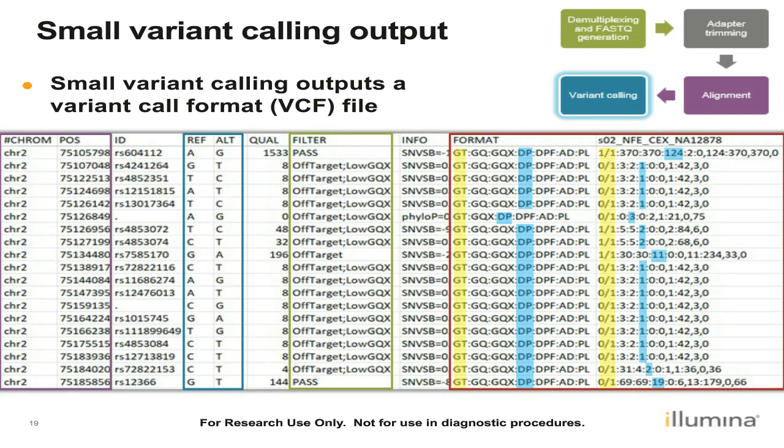And next, we will move to the allele depth, or AD. And again, I'm going to go up to that top variant. What we're seeing here, instead of a single number, we have two numbers separated by a comma. And that's showing us the number of reads, of that total depth, that were found to be either the reference or the alternate. And not surprisingly here, we see 0,124, which is telling us that no reads were found to have the reference sequence at this position, and all 124 were found to have the alternate allele.